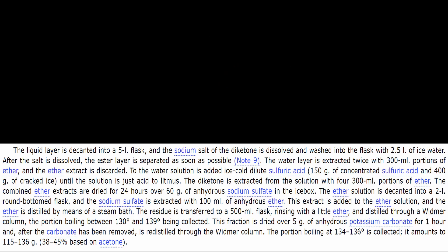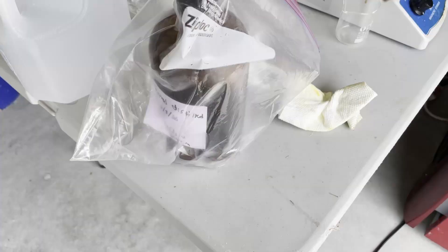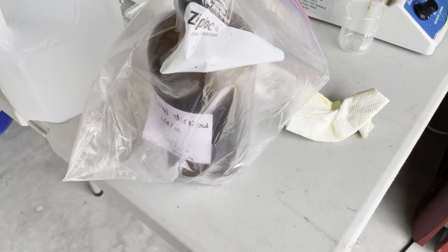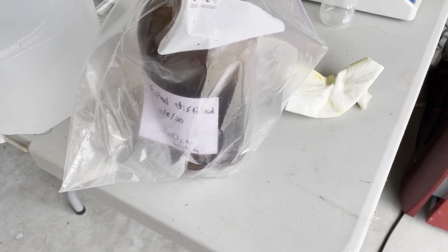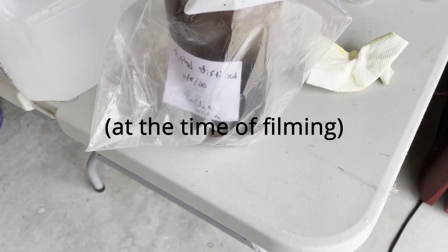The reason why I need diethyl ether, and I actually do need a decent amount of it, is because of the extraction process after the acetyl acetone synthesis. Now I had a little bit of diethyl ether left over from before I headed off to college, so I took that out — I had about 100 milliliters — and I decided to test it for peroxides, since at this point it was around six months old.